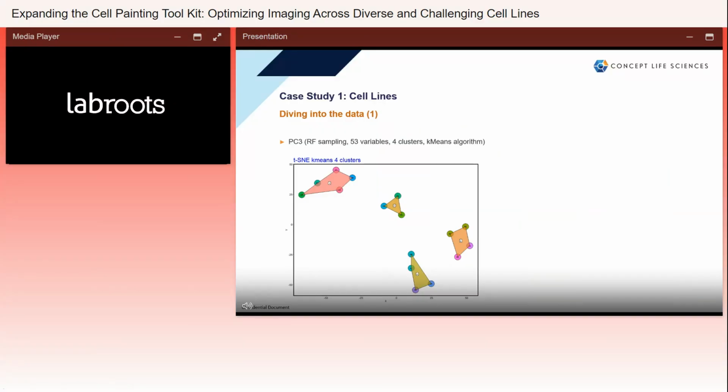And as I've mentioned, there's a vast amount of data that comes along with cell painting, so much so that it's unwieldy for one person to analyse and practically impossible to do without help from algorithms. To visualise all this data, we can employ a dimensionality reduction technique such as principal component analysis. This technique crunches all the numbers and projects it into principal components or groups that capture the greatest variance in the dataset. It's an incredibly complex technique, and I'm not a statistician, so I won't go into it in detail, but suffice to say it allows distinguishing between different phenotypes where clusters that appear close to each other on the plots should look similar.